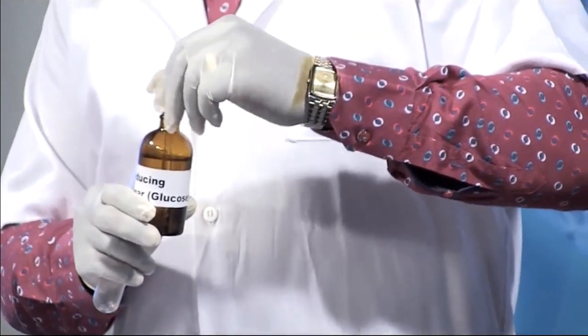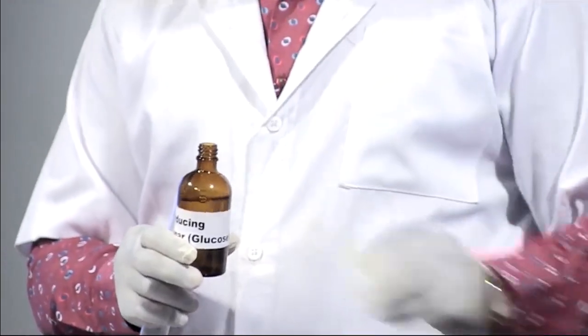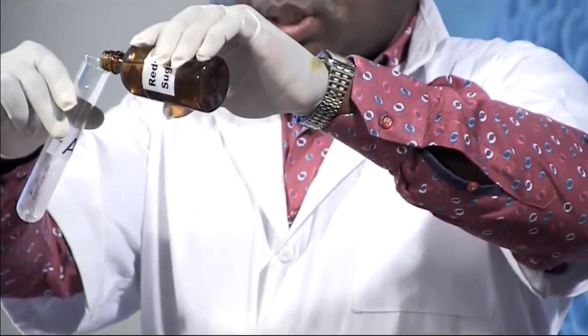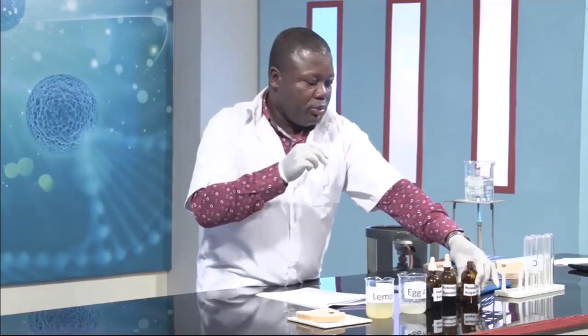Here we are looking at glucose. We can just pour a small amount, about 2 cm cube. This is glucose solution from the pineapple.